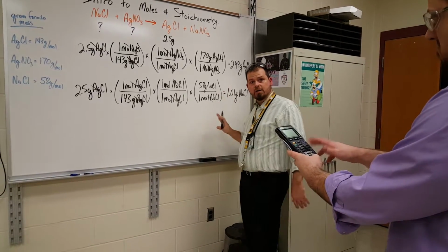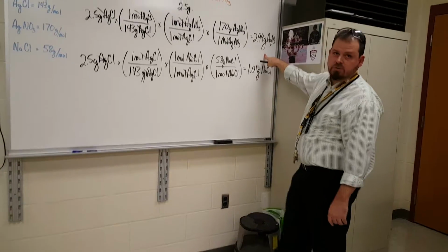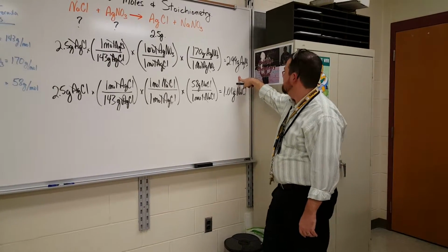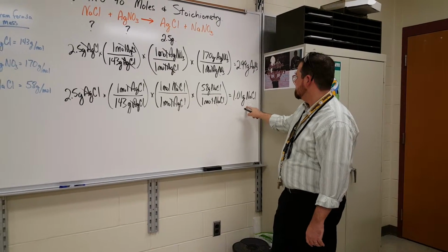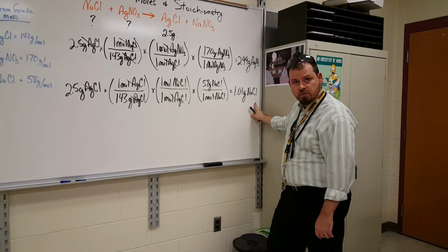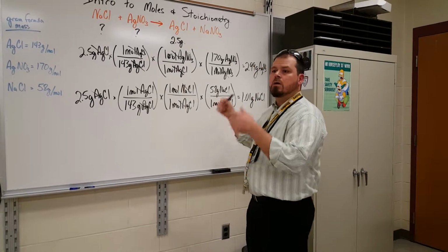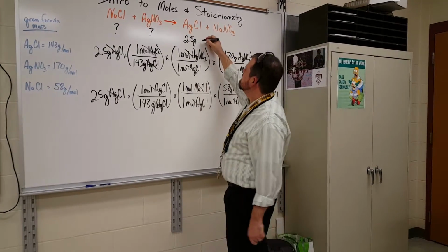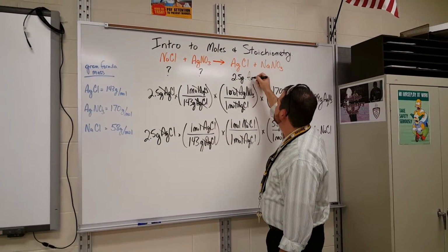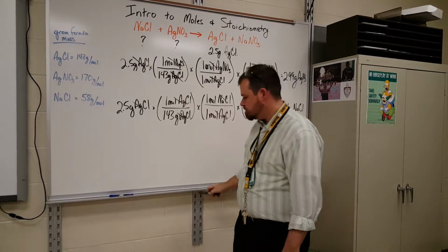So, according to our calculations, I'll go weigh that out. I'll get ready to weigh almost 3 grams, 2.99 grams of silver nitrate, and 1.01 grams of sodium chloride. If I make 2 solutions of those, put them together, let it react, dry it out, should produce 2.5 grams of AgCl, silver chloride, just like we want. So here we go. Let's check it out.